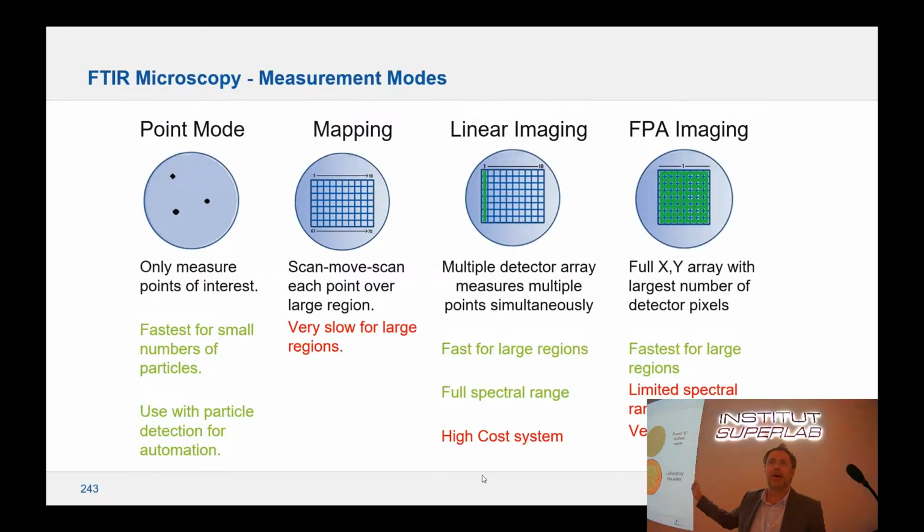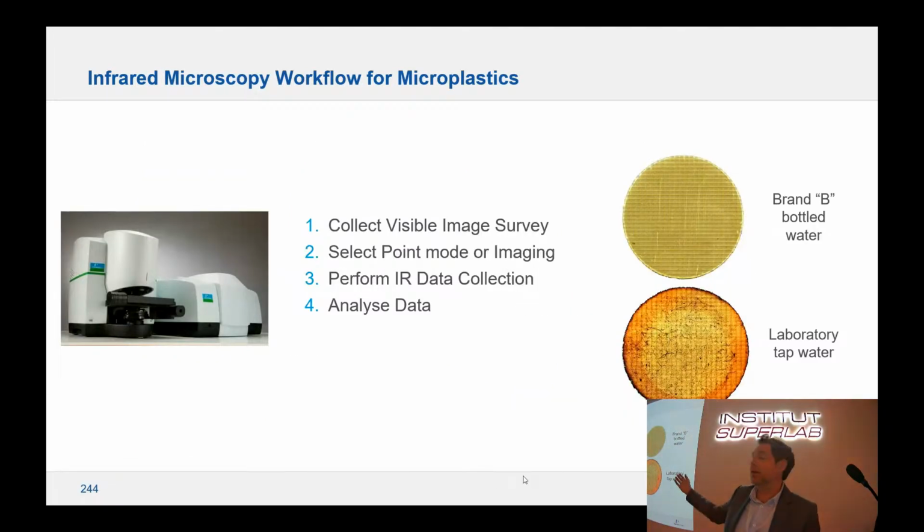Look at the bottom right. This was quite interesting, in that we thought there would be more microplastics in the water supply in our lab in the UK. But when you look at it, there was actually a lot, quite worryingly a lot actually. And this was purely, we weren't expecting to show this as a real example. We were just using it as a base. And we realized actually our water supply in High Wycombe in the UK was actually pretty bad.